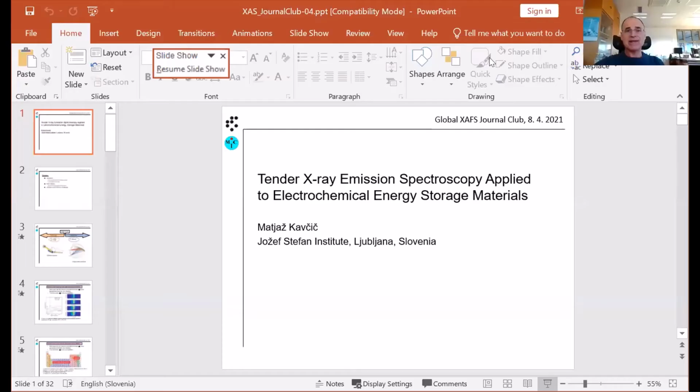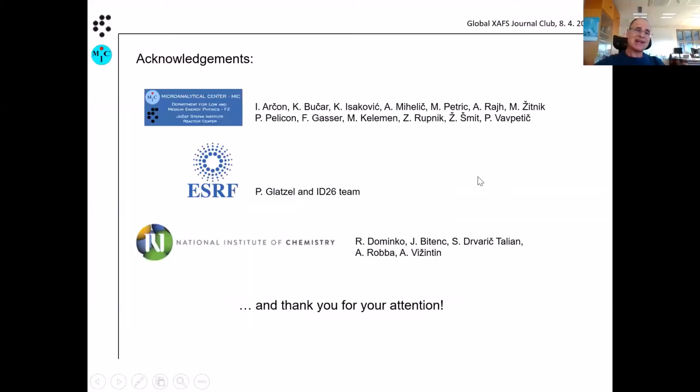Yeah, you're right. A good question, actually. I like it. I didn't show it here, but basically in all of the spectra that we have collected, for example, on a sulfur standard at home, we have it inside. But just for the purpose, because people are used to comparing with synchrotron data, I take it out because the shift is quite large, so they are well separated from the main line.